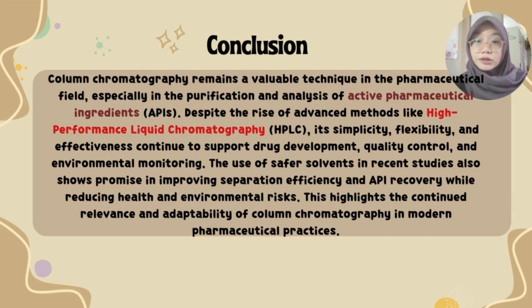The use of safer solvents in recent studies also shows promise in improving separation efficiency and API recovery while reducing health and environmental risks. This highlights the continued relevance and adaptability of column chromatography in modern pharmaceutical practice.